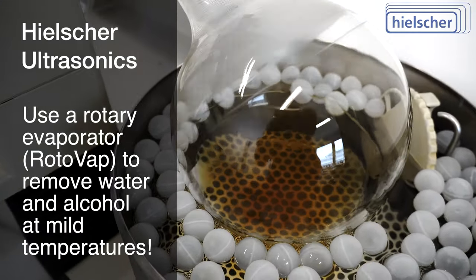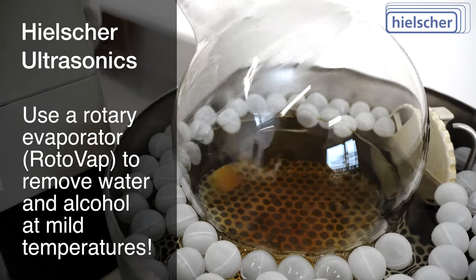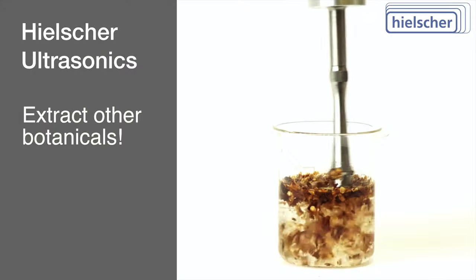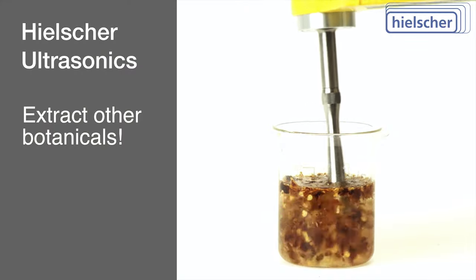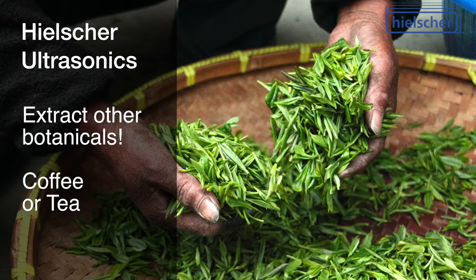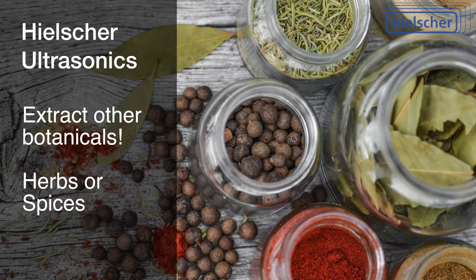After separation, you can use a rotary evaporator — a rotovap — to remove alcohol and water at mild temperatures to produce a concentrate. With the UP100H, you can also extract other botanicals, such as cannabis, medicinal plants, coffee or tea, herbs or spices.